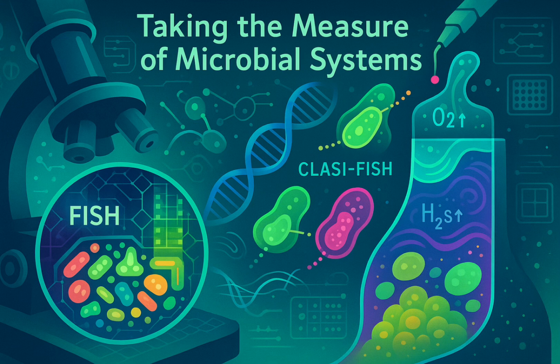Okay. And MAR-FISH. Sounds similar to BONCAT-FISH, but with radioactivity. Similar goal. Yeah, linking identity and activity visually. MAR-FISH combines microautoradiography, MAR, with FISH, figure 19.41. Here you feed the sample a radioactively labeled substrate, maybe 14CO2 or a tritiated 3H compound. So active cells become radioactive. Right. And you do FISH to label the cells you're interested in.